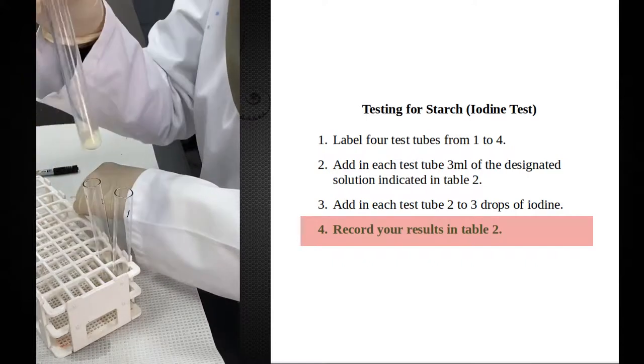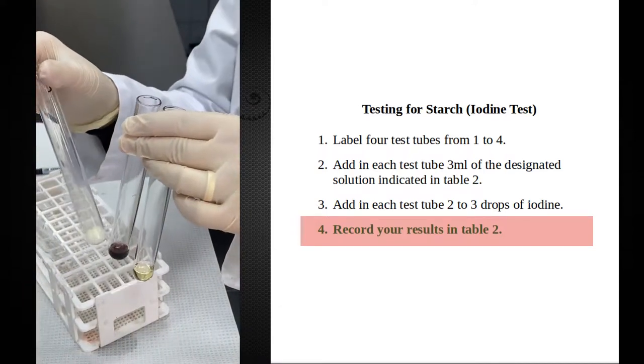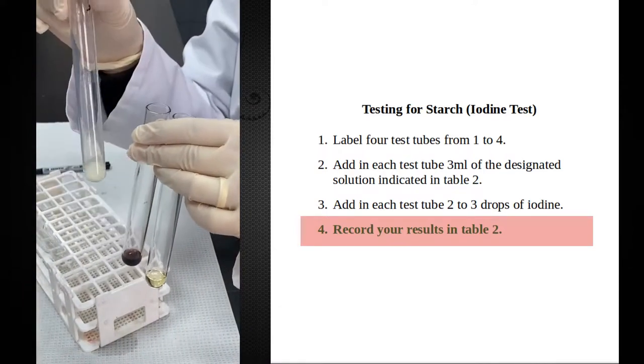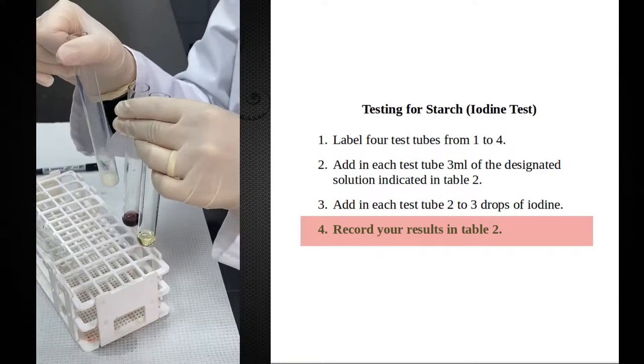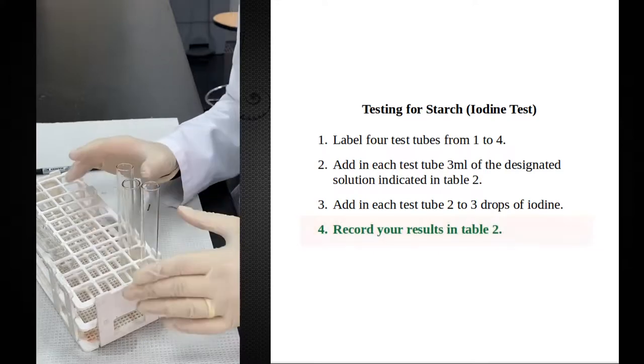And this is the result of the milk. As you can see, milk result is closer to the negative control than it is to the positive control. And therefore, there are no starch inside the milk. This is the test. And this is how you can test any solution for the presence of starch.